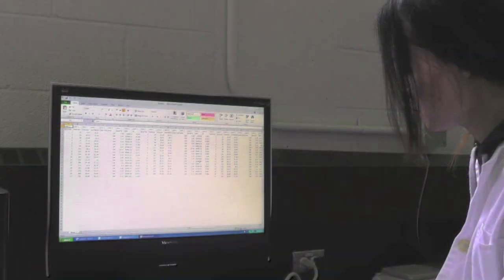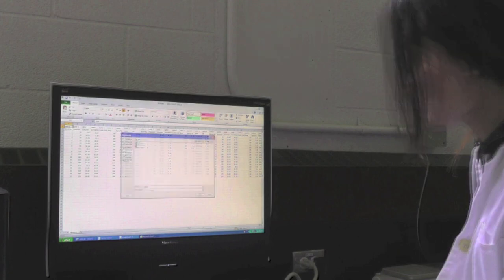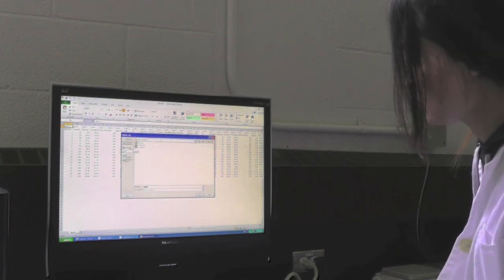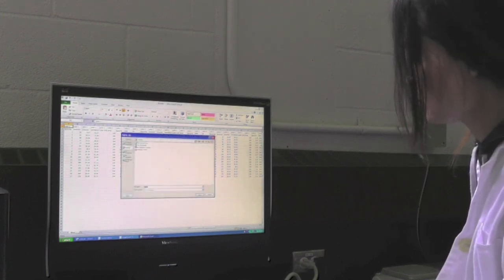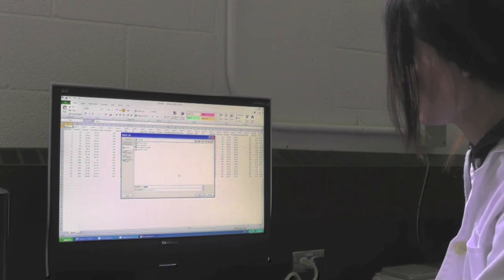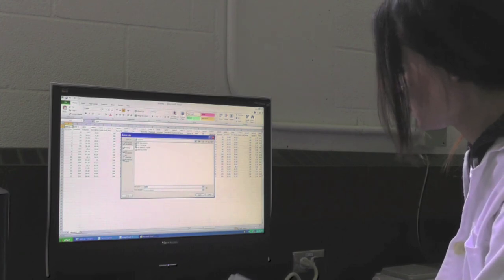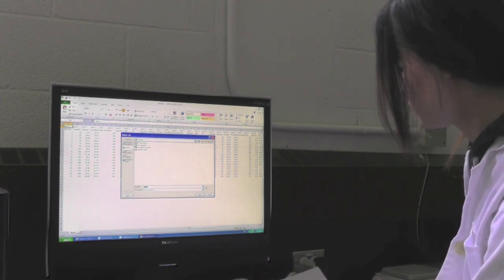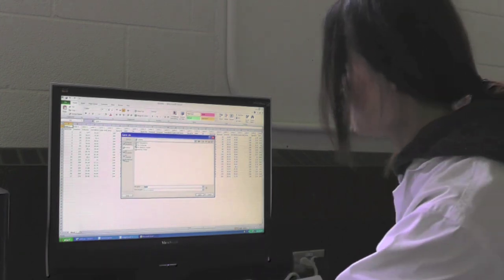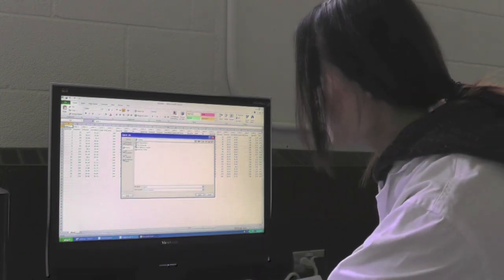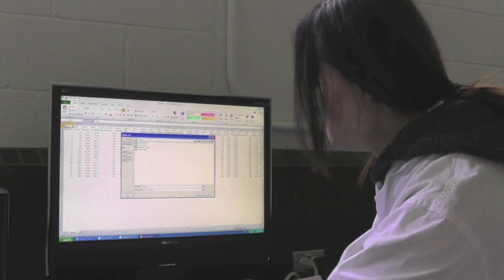An Excel sheet with all your data will appear automatically. Save your Excel file, your original gel image, and your converted gel image with the bands identified to your USB for your report.